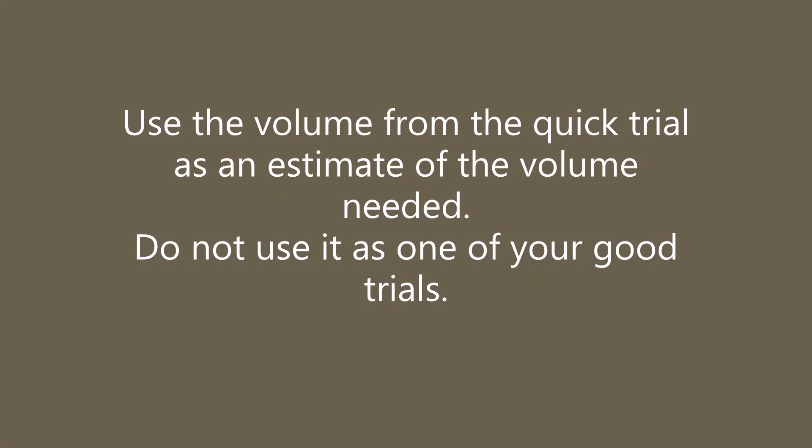When you've reached the end point for the quick and dirty trial, record the final volume. Subtract the initial from the final to get the volume of titrant used for the quick run. This gives you an approximate volume, but will likely be more than is needed for a precise titration.